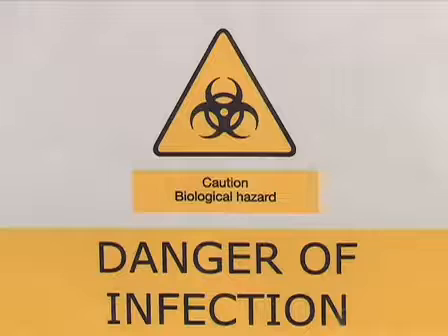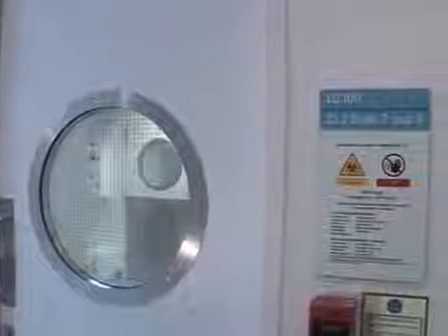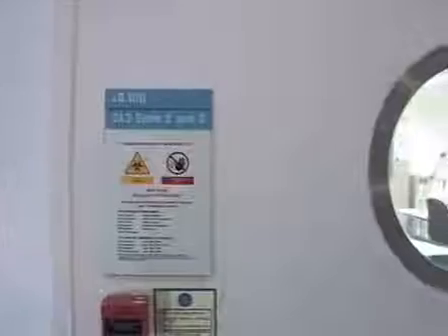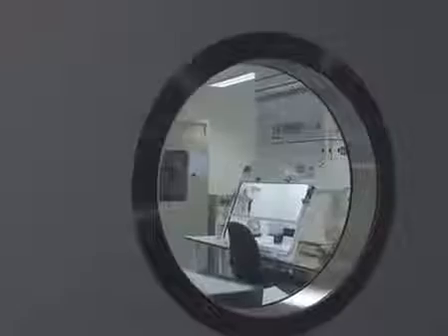To electroporate mycobacteria, we need to make electrocompetent cells. It is important to remember that pathogenic mycobacteria represent an important biohazard. Therefore, all culture and genetic manipulation must be carried out in appropriate containment facilities inside a Class 1 safety cabinet. Risk assessment must form the first part of any experiment with pathogenic mycobacteria.